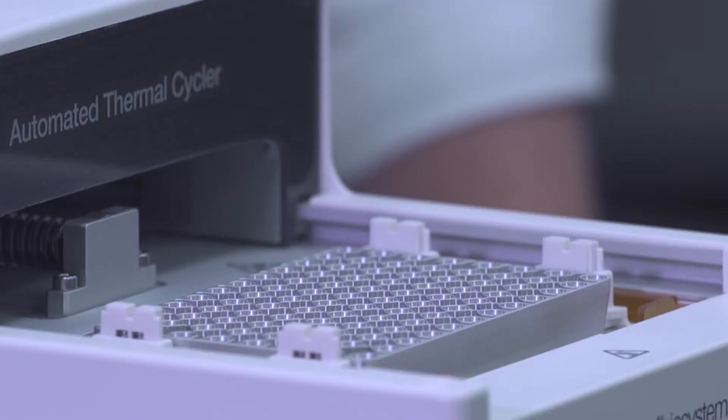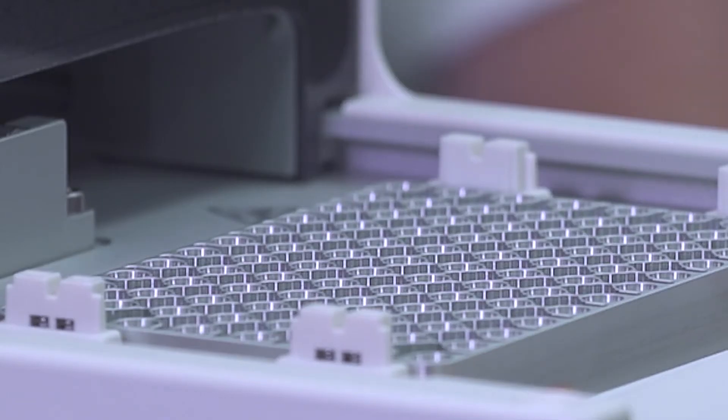You might be familiar with this issue if you've ever had a plate stick to your thermal cycler block after the run, causing the need to lever off the plate with a spatula. The lack of distortion with the polycarbonate frame means the Endura plates and the Armadillo PCR plates are easily removed from the thermal cycler and remain flat after PCR.